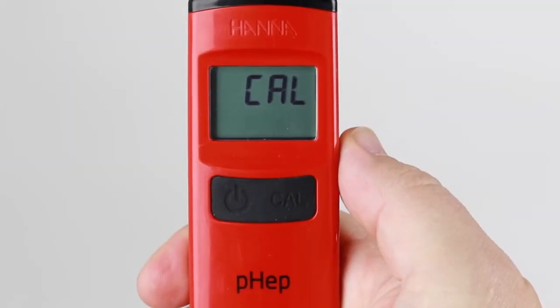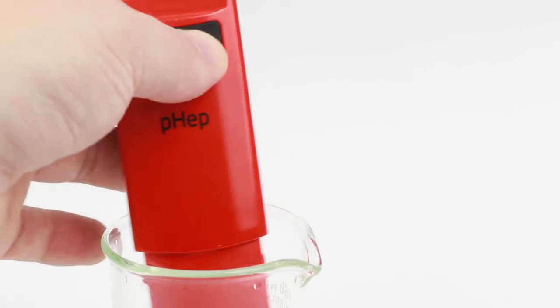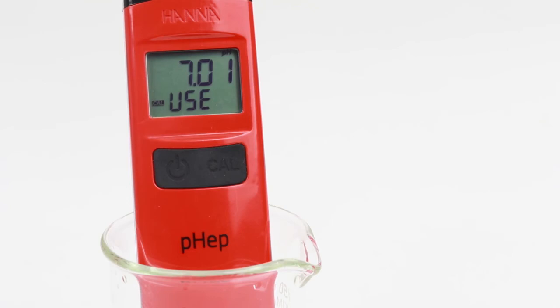To calibrate the meter, press the Cal button while the meter is on to enter calibration mode. For two-point calibration, the meter will prompt for the pH 7.01 buffer. Once the buffer is automatically recognized, the buffer will be updated and REC will be displayed and the meter will then display pH 4.01.